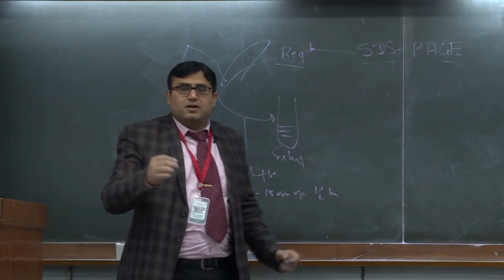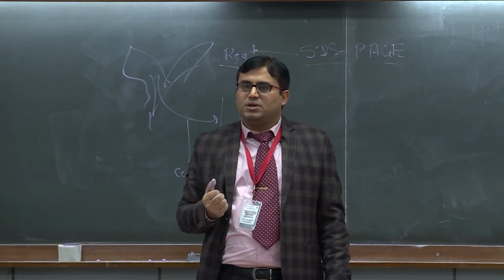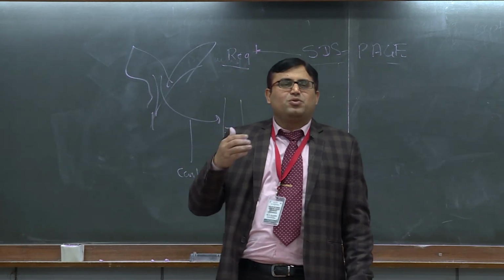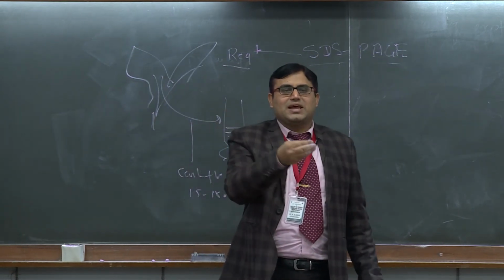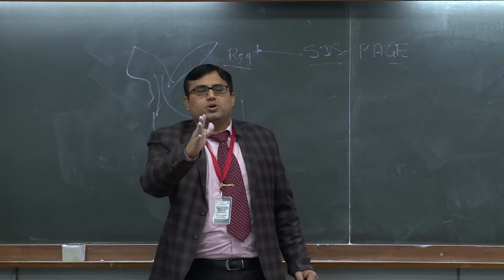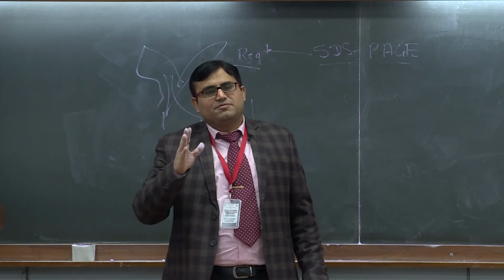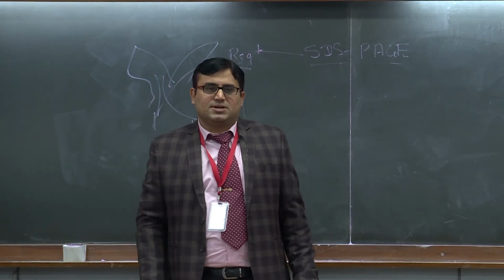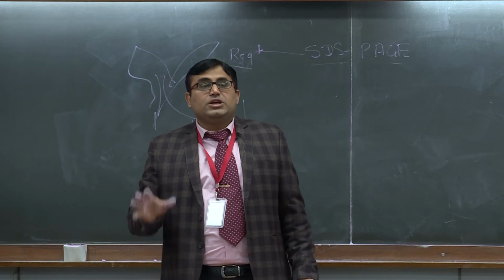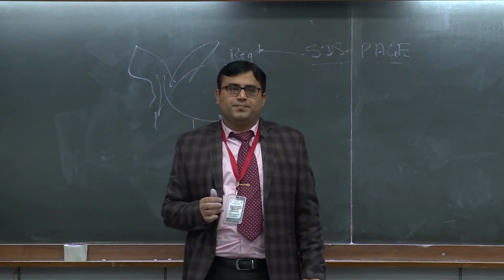Minimum time is half an hour in order to get from small molecular weight to high molecular weight protein. Many times it happens that we go for 12,000 RPM for 10 minutes, like what we do in molecular biology. Let me tell you, 50% of the protein will stay in the tissue itself. You will only get 50% protein out of your extract, right? So in proteomics, duration is very important, it should be higher.